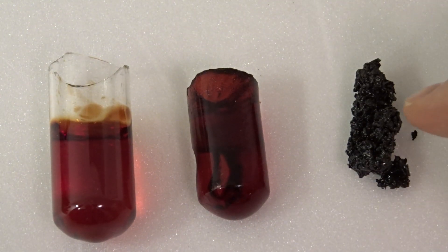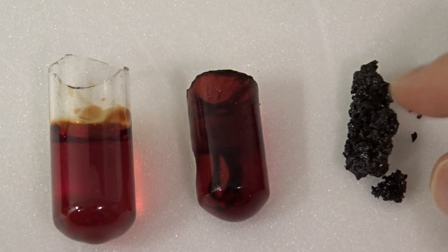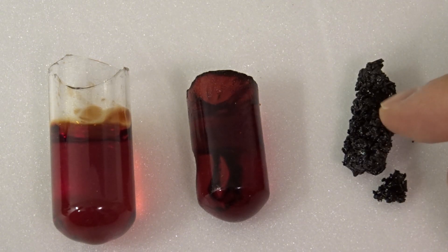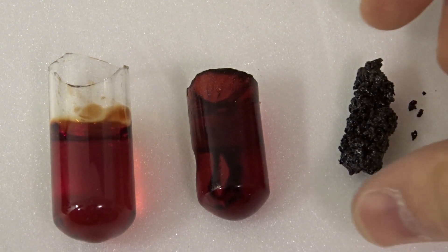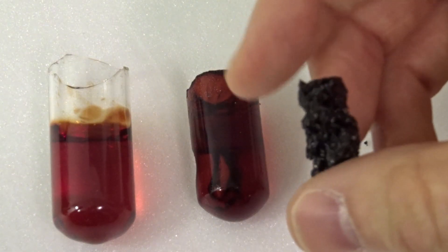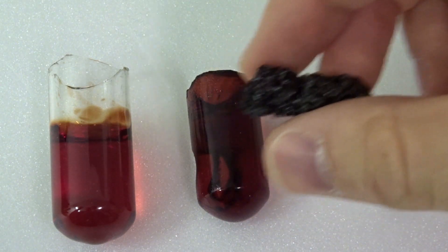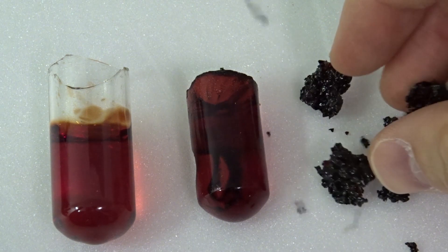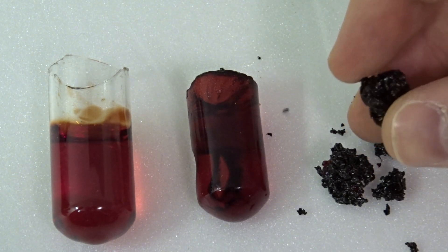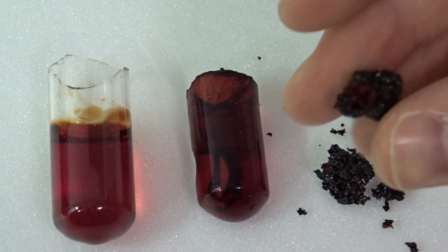Here on the right you see a Bakelite sample that was Bakelized without pressure — so this was done outside the Bakelizer — and it's pretty well known to be pretty much useless. It has almost no structural integrity and it breaks right away. It's very crumbly and you can't do much with it — you can't make little crafts or shapes. So this shows you just the necessity of using a Bakelizer.